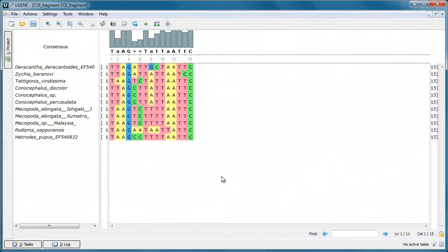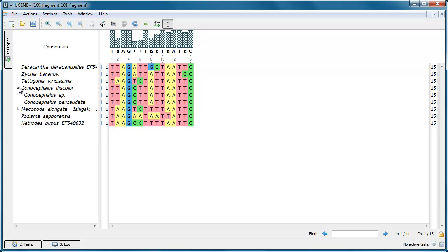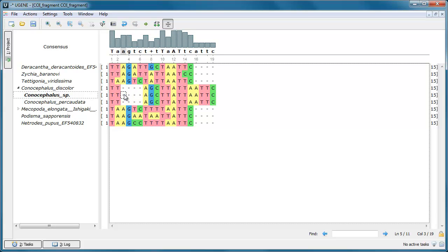A new handy feature was added to the Alignment Editor. The feature allows one to collapse rows with the same characters into one row. Note that if the rows collapsing mode has been enabled, then all the rows can be edited in the same way.